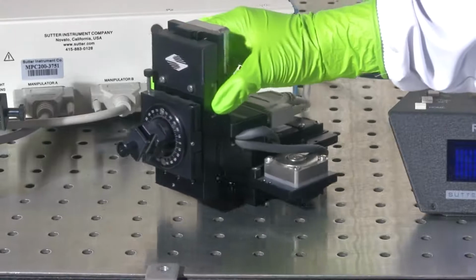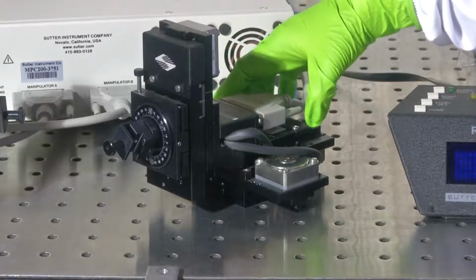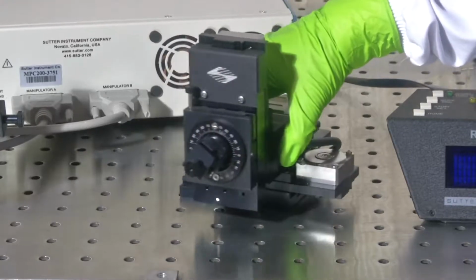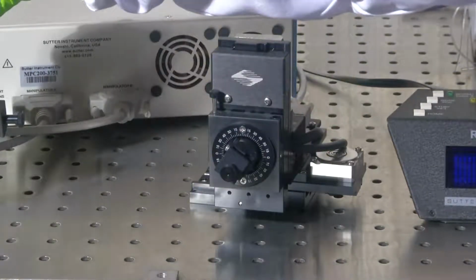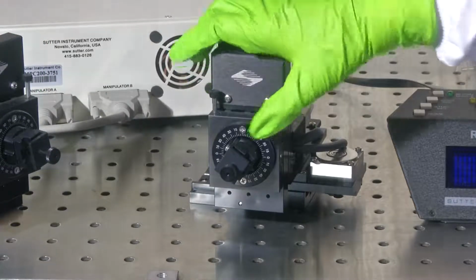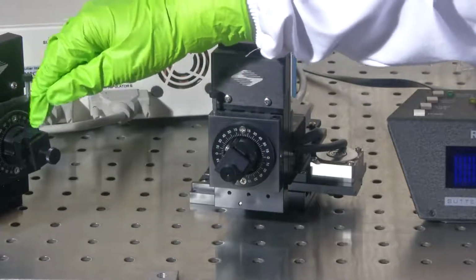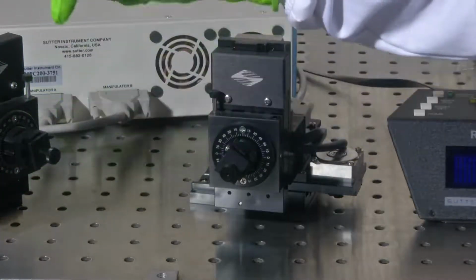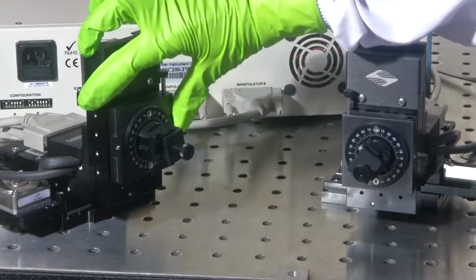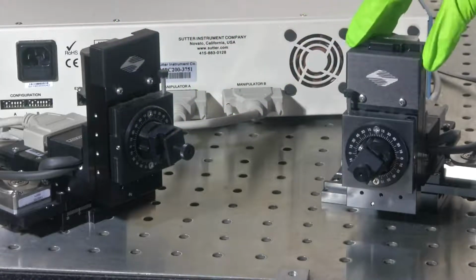Now that we have seen how it can be manipulated on all three axes x, y and z through various motors that are connected on each of these axes, with similar features on the other manipulator. The slot here also provides you with an option to connect to multiple indenters. So, you could customize this entire tool holder based on your application and purpose.